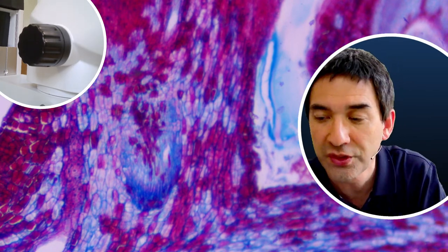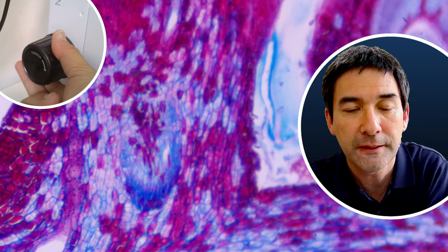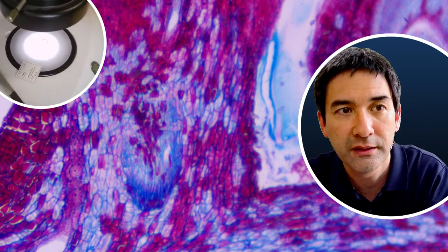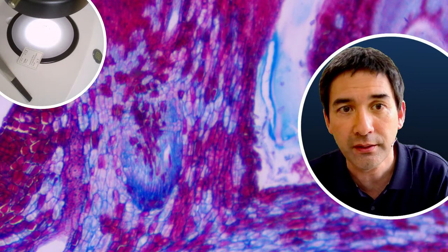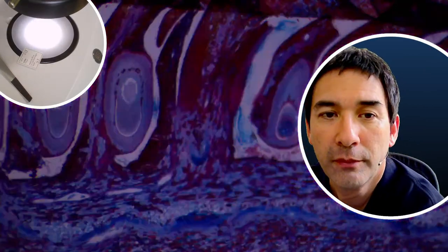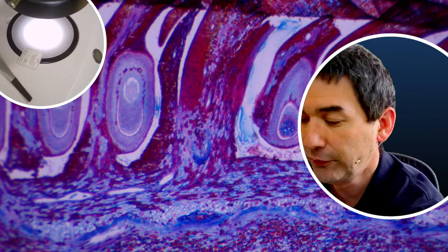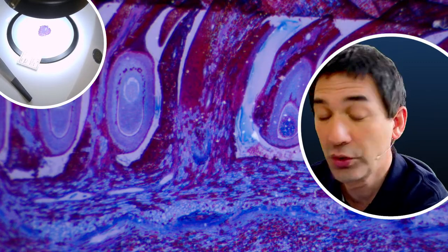Focusing happens by turning the knob on the side. The focus changes as I turn it. Now I'm going to try out different types of lighting. The camera will readjust its exposure every time. At lower magnification, there's a greater depth of field. Right now I have light coming from the bottom. Now I'm switching to the ring lamp — this also works quite well. And then there's also a separate lamp on the side.